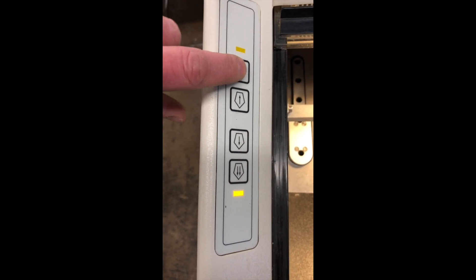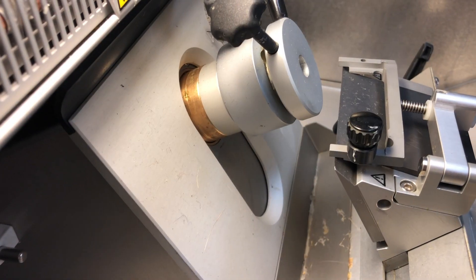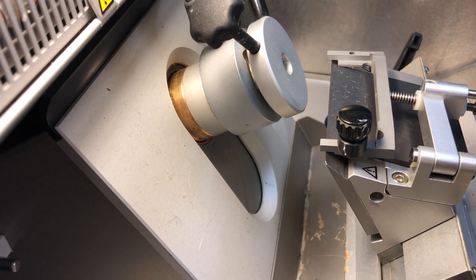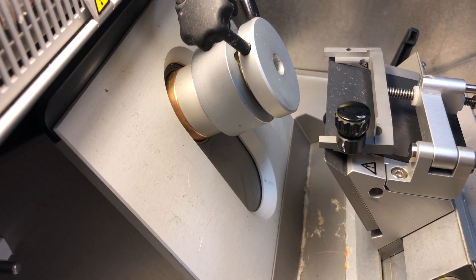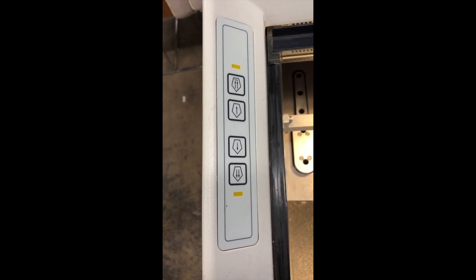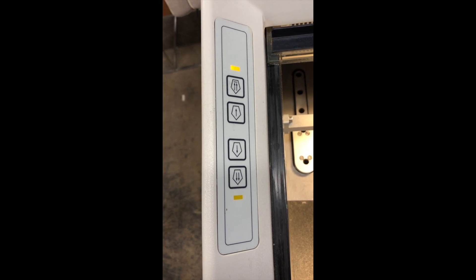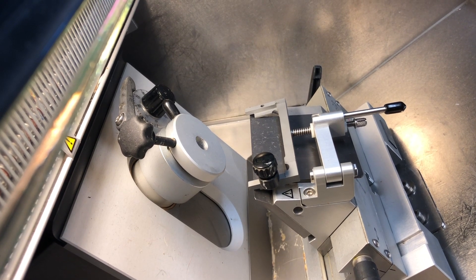Now we'll press and hold this back button until it starts to blink. The object holder is moving back — it's not in a hurry, but it's on its way. This light will continue to blink until it gets all the way back. And now we have plenty of room between the knife holder and the object holder.